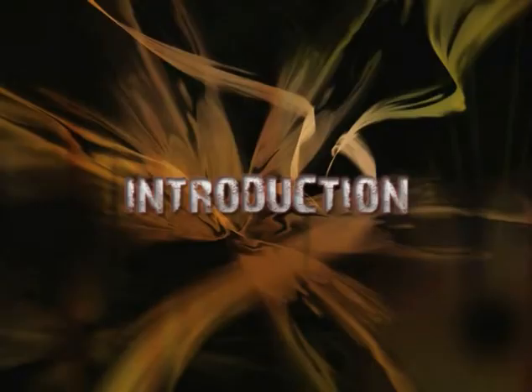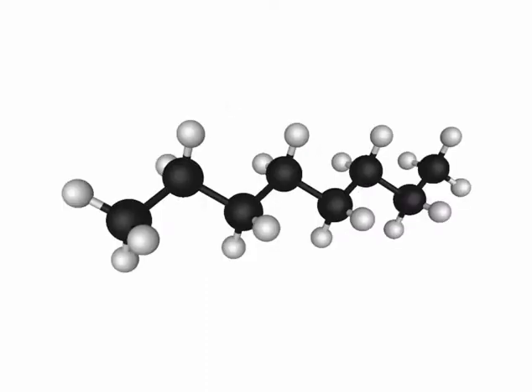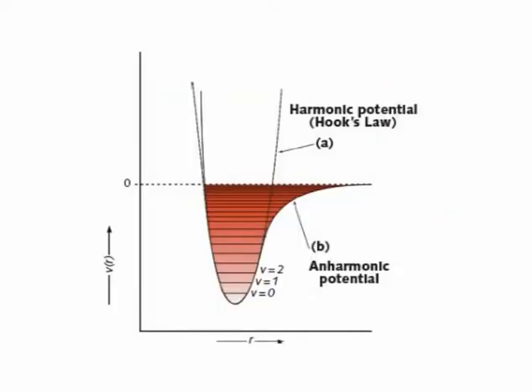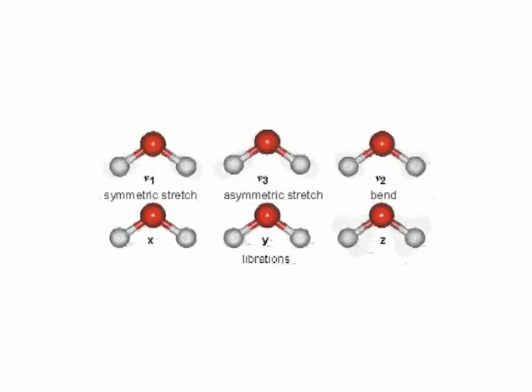Introduction. Spectroscopy is a very useful technique to determine molecular structures. IR radiation does not have enough energy to induce electronic transitions, as seen with UV. Absorption of IR is restricted to compounds with small energy differences in the possible vibrational and rotational states.